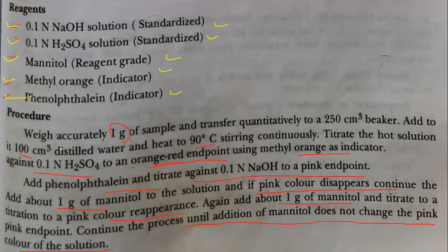So what is the procedure? Take 1 gram of sample, transfer it to a 250 ml beaker, then add 100 ml of distilled water and heat that to 90 degrees Celsius continuously. Titrate that hot solution against 0.1 normal H2SO4 solution in the presence of methyl orange indicator. The end point will be orange to red. Okay, so this is your end point.